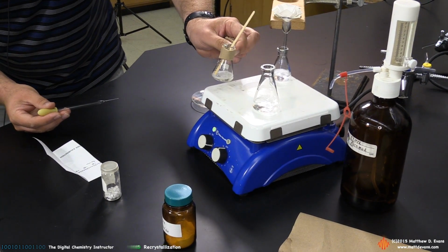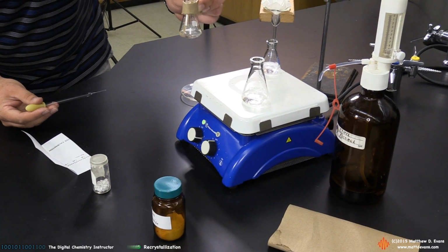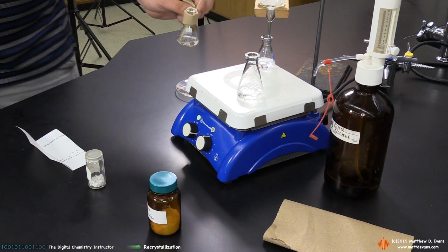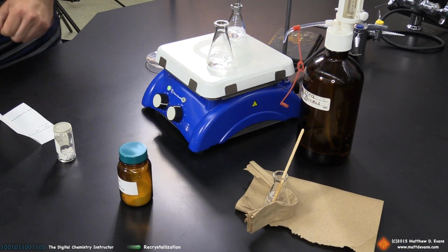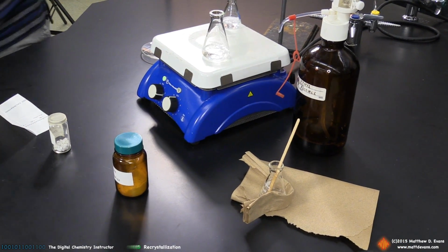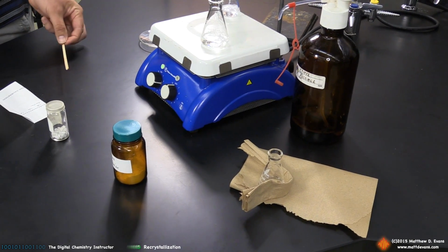I'm going to check it. I know I said not to take it off the hot plate, but I just need to check it real quick. Looks like we're already there, actually. It didn't take too much hot solvent, so I'm going to take it off the hot plate. Nice thing about a boiling stick is that I can take this out easily, unlike a boiling stone, so that's why you want to use a stick.